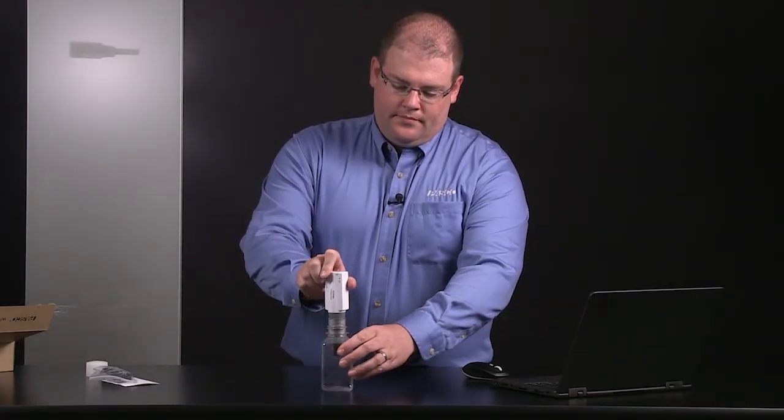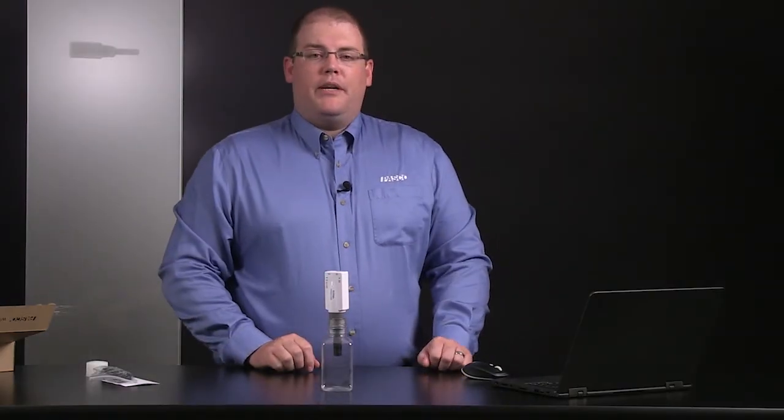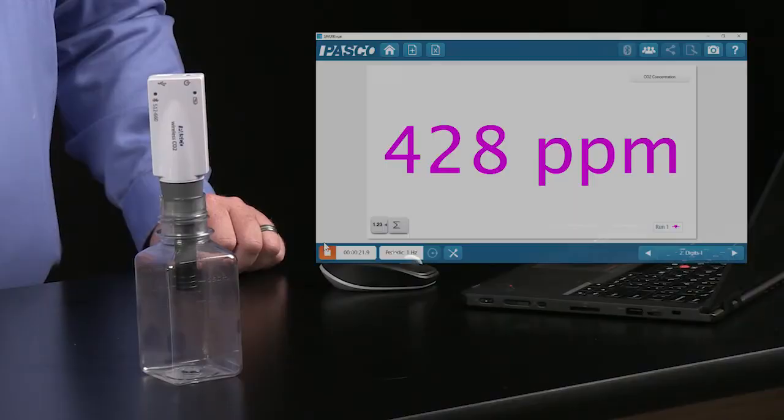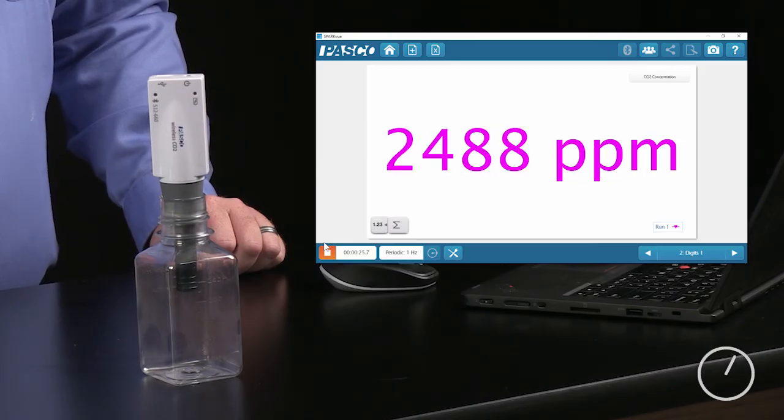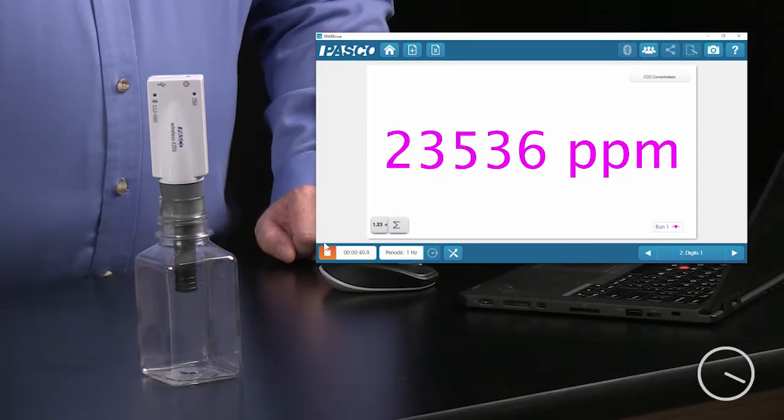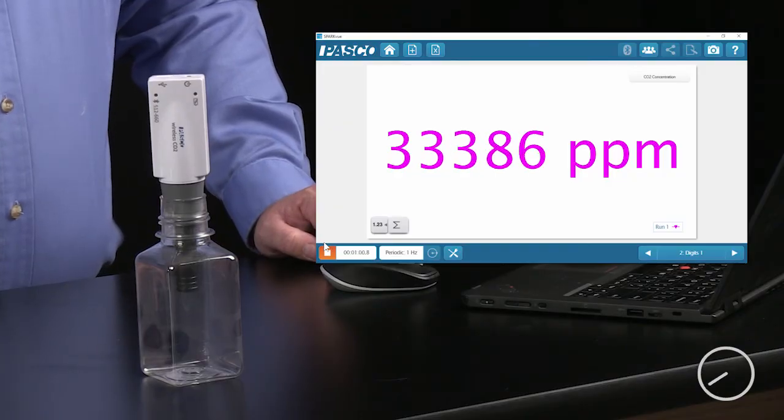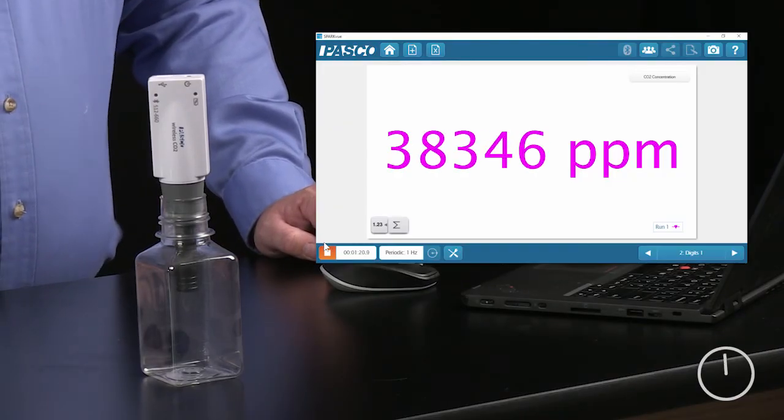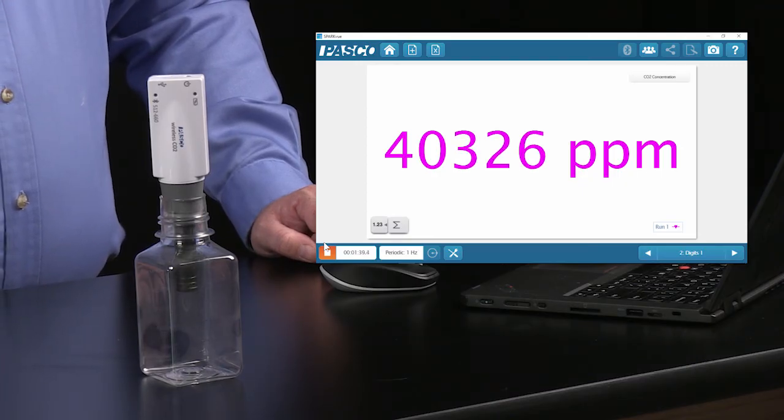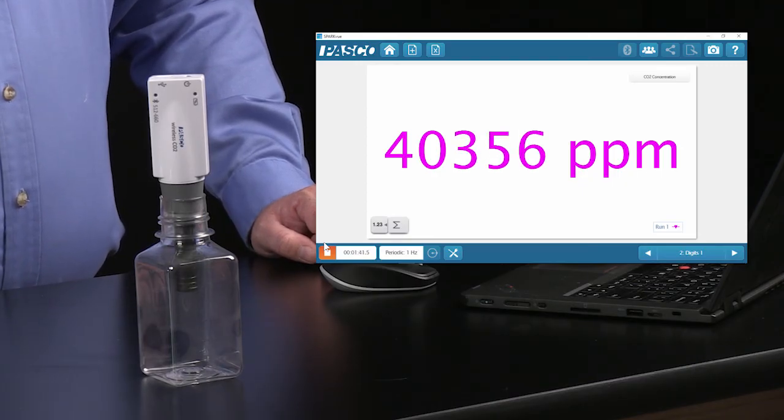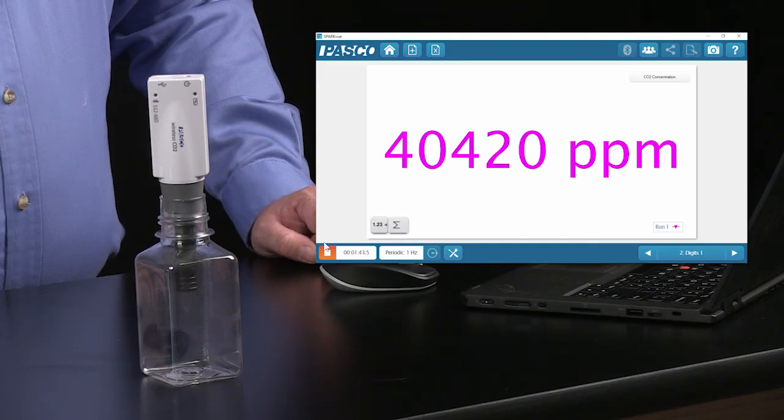I'll insert the sensor and wait about a minute for it to equilibrate. For most people, we'll expect the final CO2 concentration to be around 30 to 45,000 parts per million.